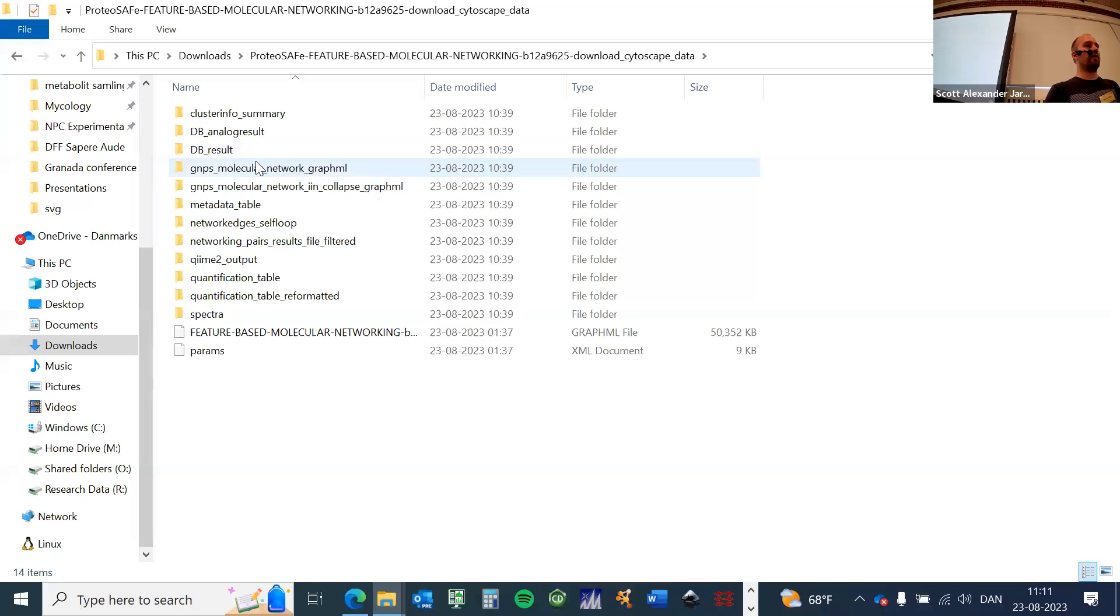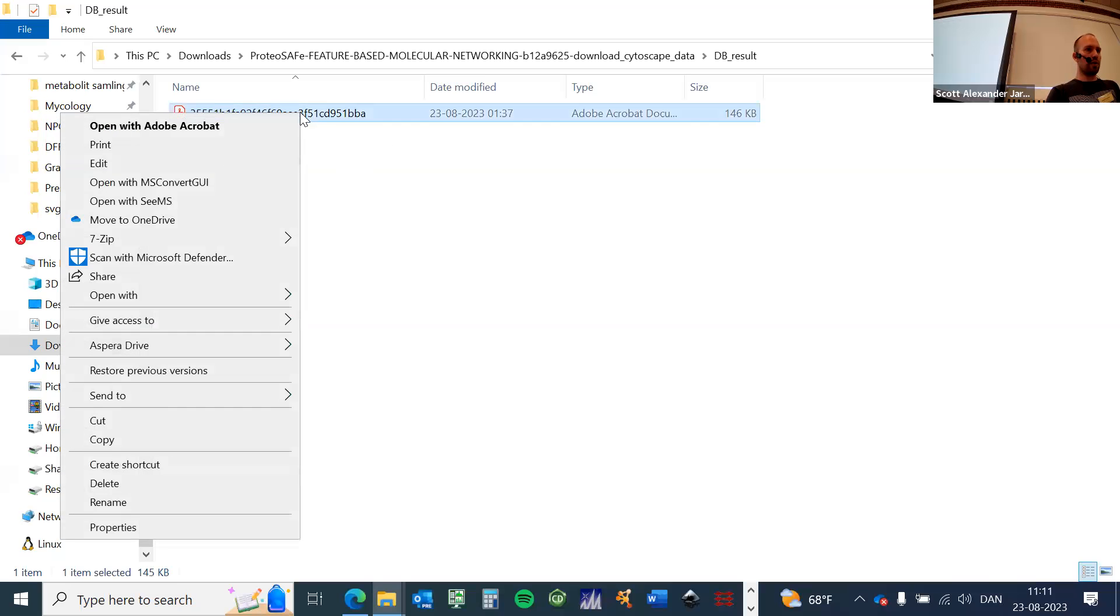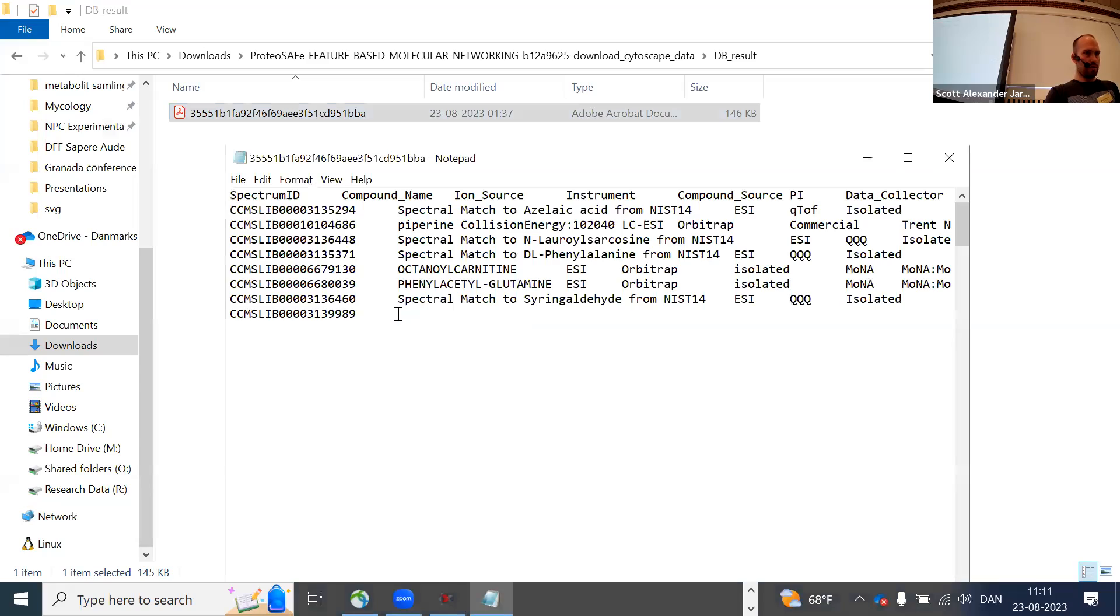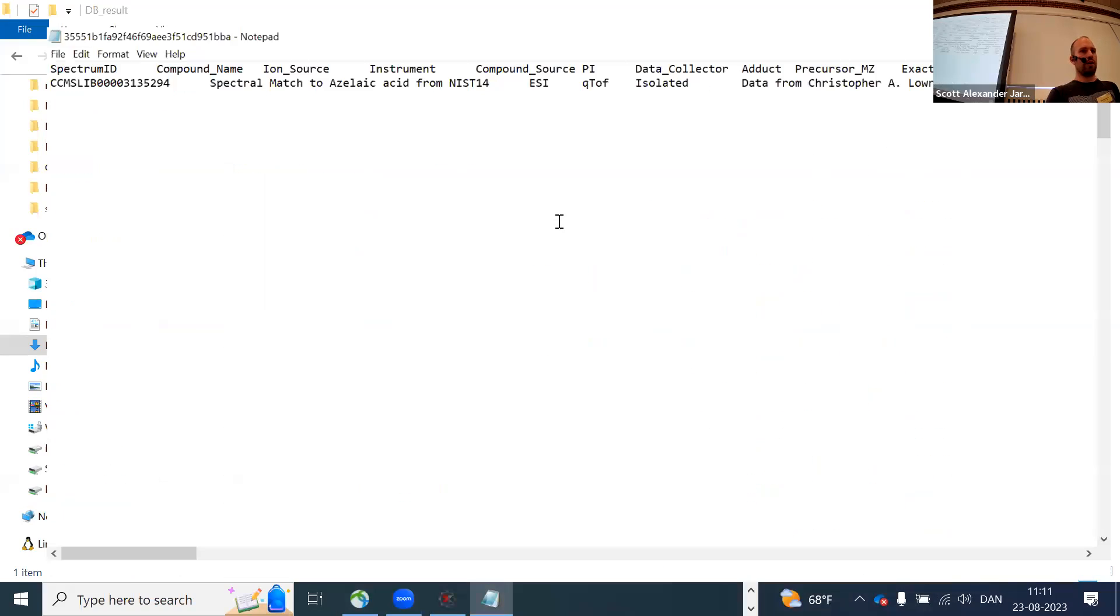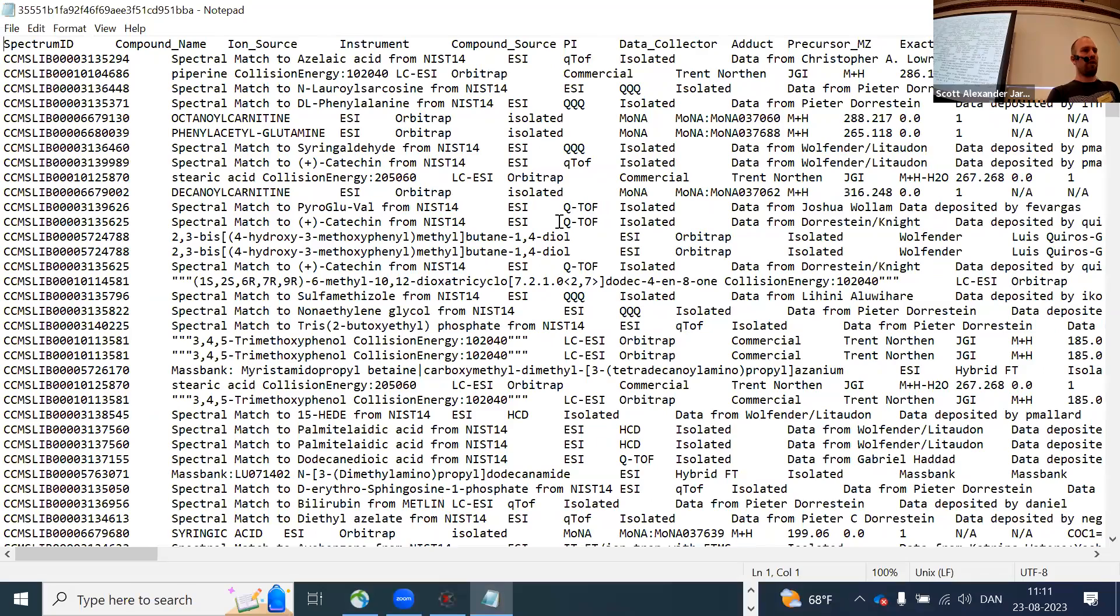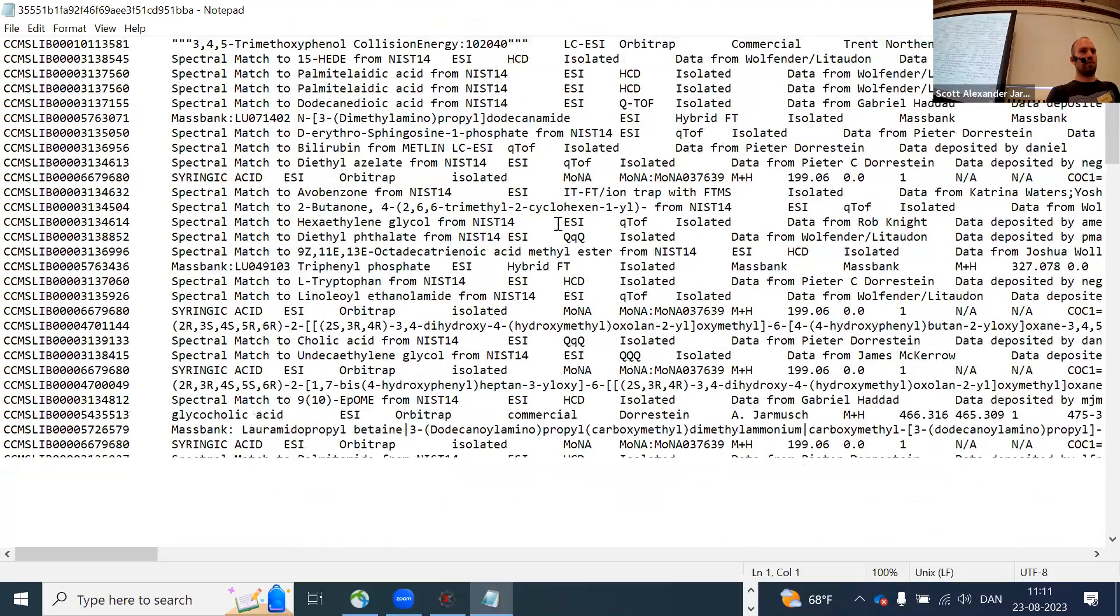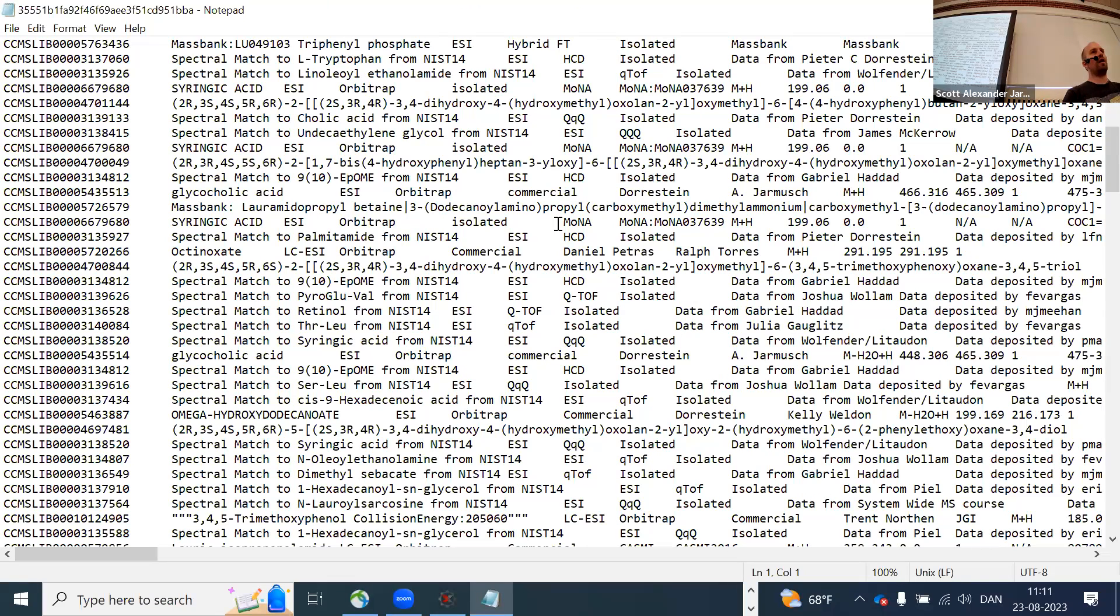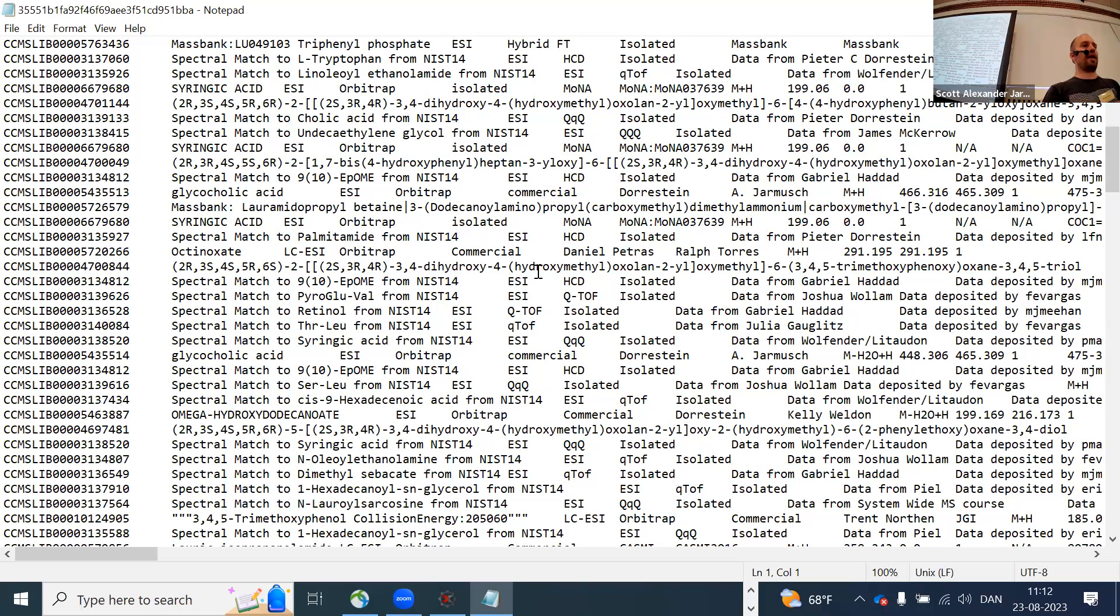If I want to now look at the library hits, here in the DB results, for example, I could open this with Notepad. Then you would get again this long list of the IDs, the same way I had it in the web browser. The difference is I don't have this interactive visualization of the mirror plots, which I think comes very handy in the online tools that I typically use. But obviously here it's much easier now to filter and handle this data.